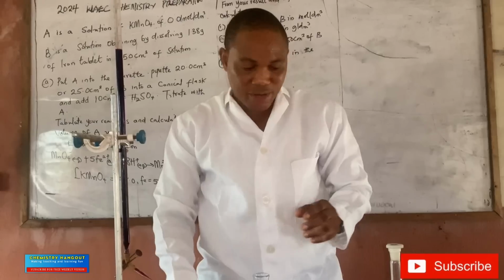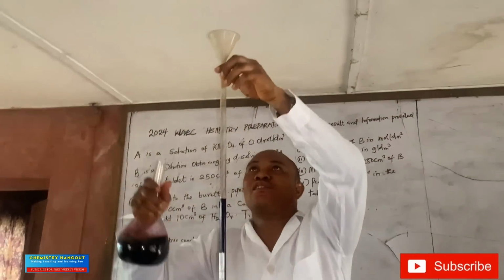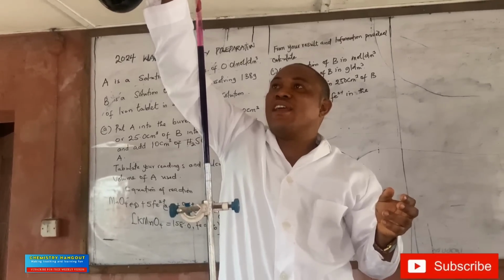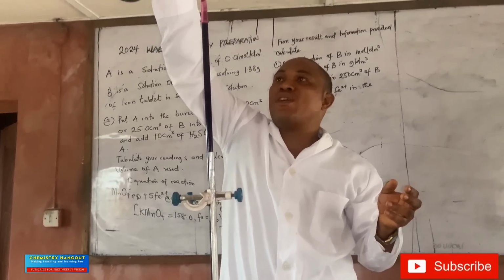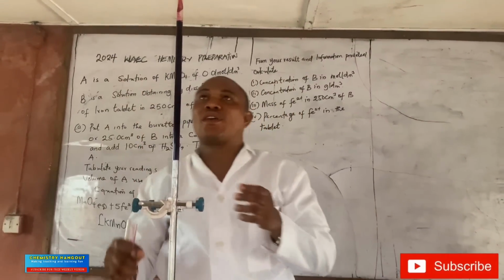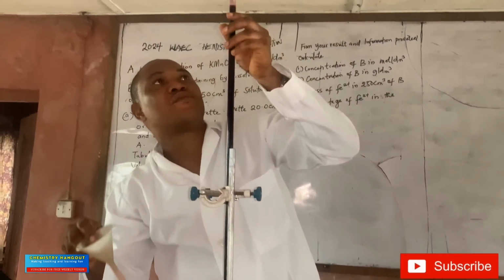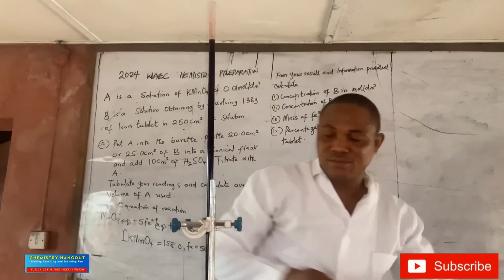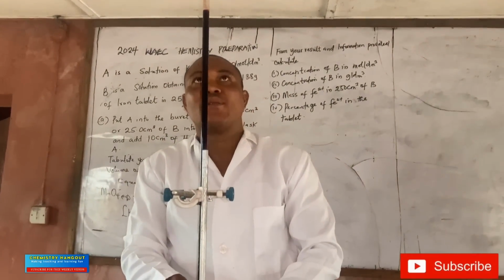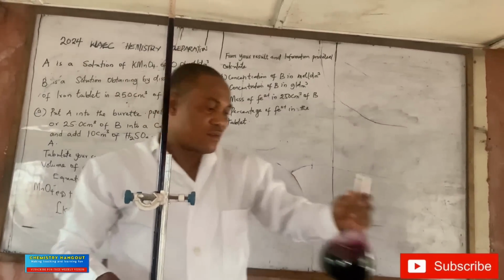Okay, so let me refill this one first. Very important. Let me refill this. I've done the titration in my last video and I've explained a lot of things, but let me just do one again so that I will not waste much time. The video is on the channel, you can watch it. It was even a live. Okay, so filled already. If you check it now, that's 0. Let me release a bit. Okay, I'm good to go.